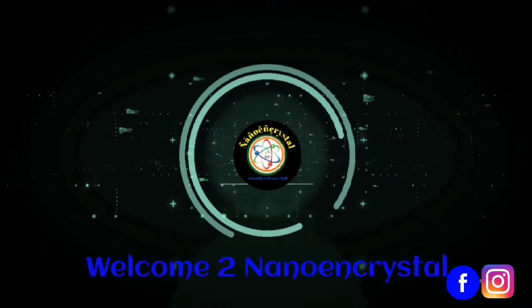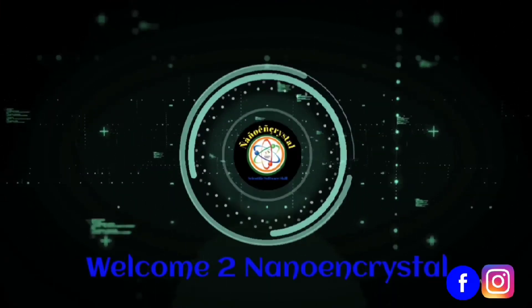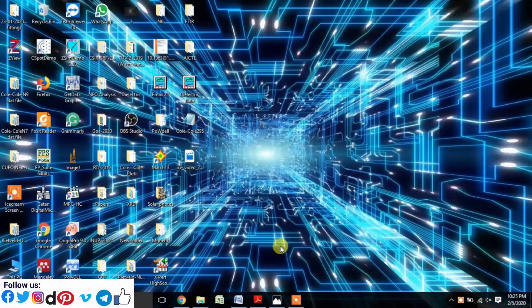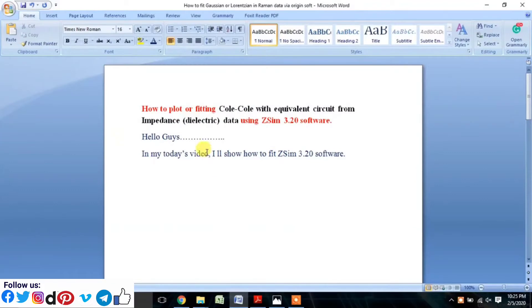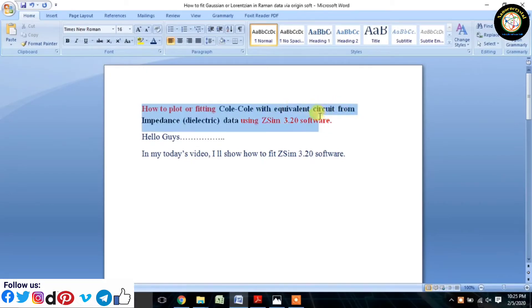Welcome to Nanoencrystal. In this tutorial, I will show how to plot or fit a Cole Cole plot with equivalent circuit using impedance data via ZSimpWin software.